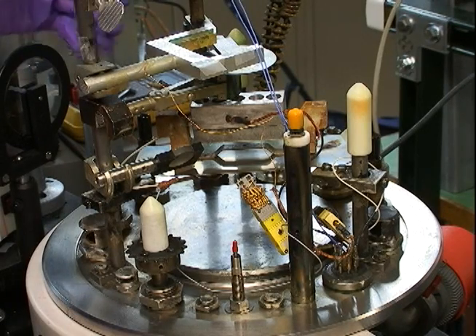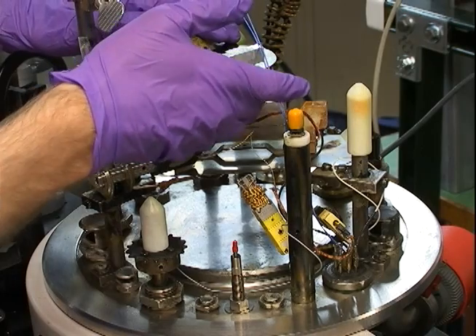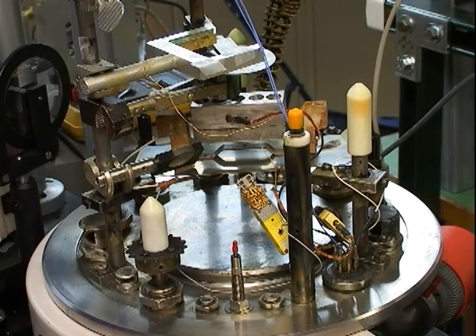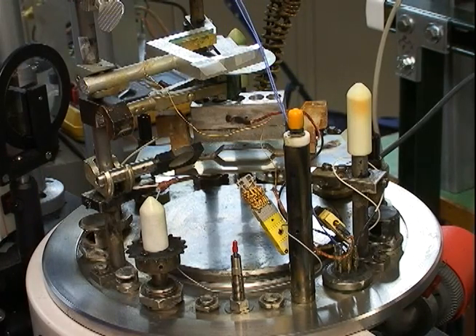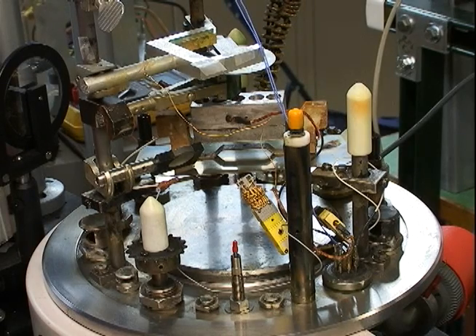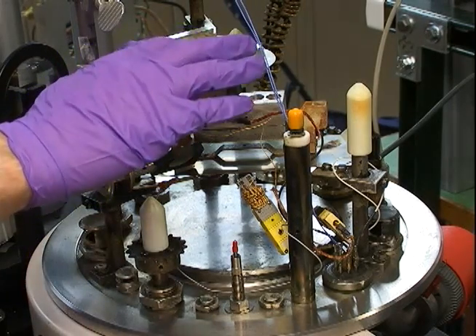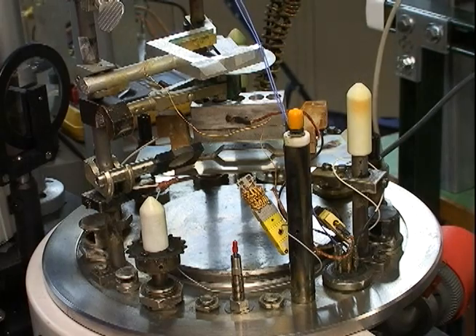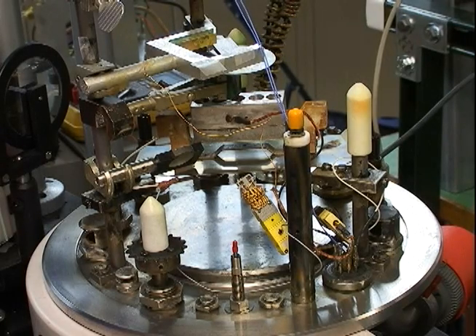On top of that, there's this shutter here. This shutter allows you to easily control when you want your chemical going onto your substrate. Above that is the substrate holder itself where you're going to put, in this case, a glass slide.